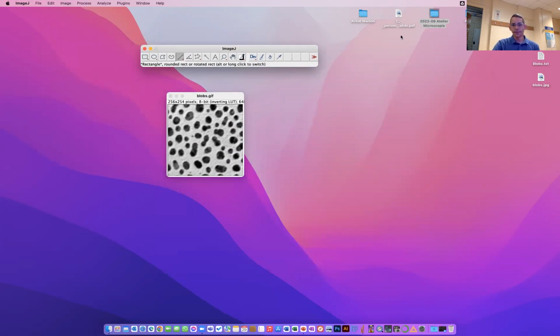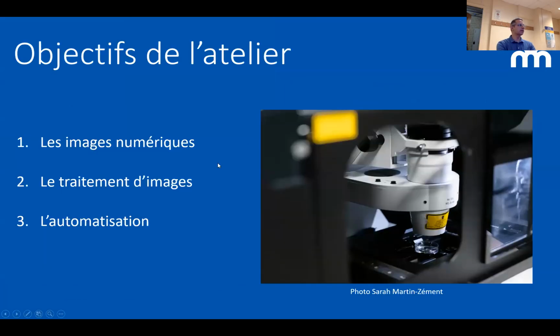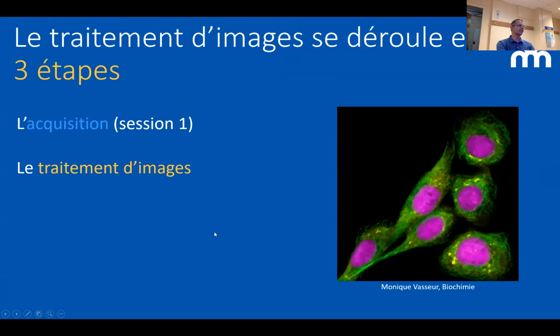Yeah. So let's go back to the second presentation. The first one was about the digital images. The next one is going to be about processing images. Image processing is a very important step to be able to analyze your image. And to do it well, you have to do it in several steps. It actually has 3 different steps.